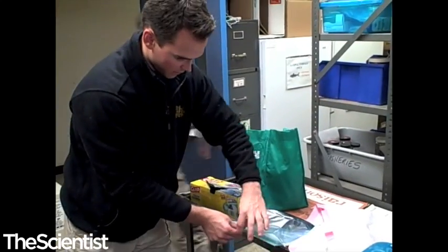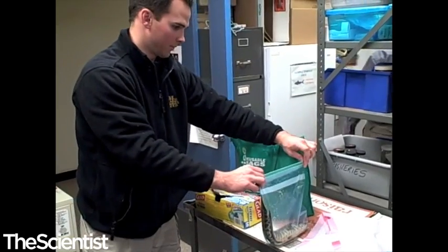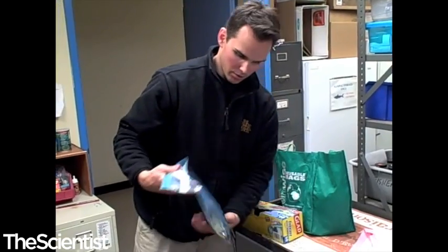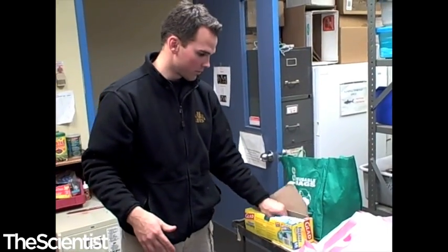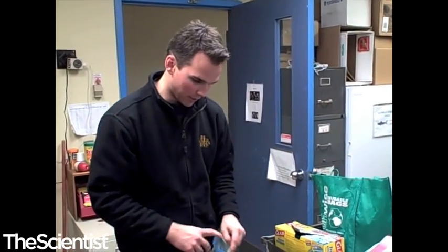Now that we're back in the lab and we've collected these today at Medjwood Lake and Meadow Lake at FDR Ponds, I'm going to freeze them. We'll take the fish, freeze them, and when we have the time we will take out the otoliths — a little ear bone inside their skull that we'll use to age the fish. We'll also look at the stomach contents and see what the fish are feeding on.